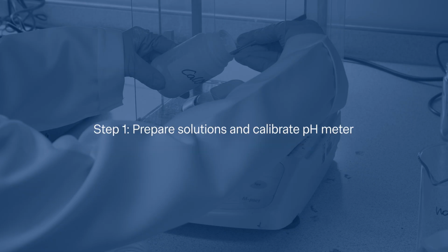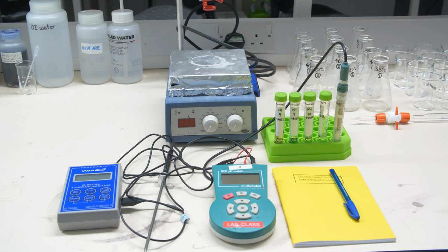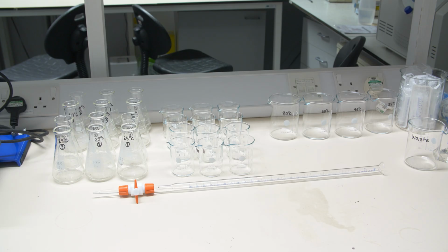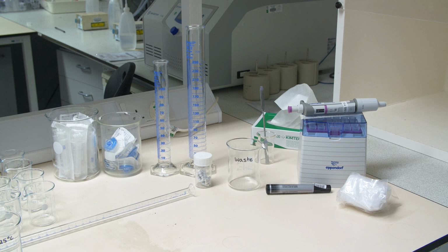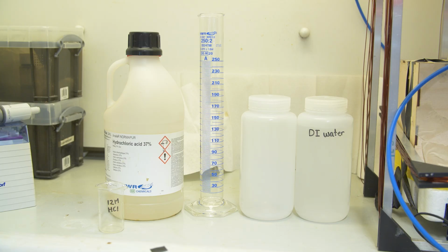Welcome everyone to the experiment on dissolution and precipitation, and in particular we are looking at the thermodynamics of calcium hydroxide dissolution. In the first step we are assembling all the chemicals which we need, all the instruments which we need, and all the vials which we need, and supporting materials like pipettes and cylinders and filters. Okay, so we put them all together, equally here the balance.